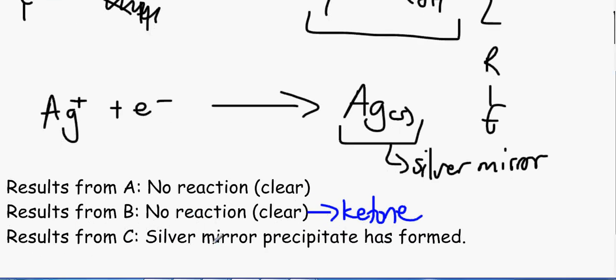And over here, a silver mirror precipitate has formed. So we know it's an aldehyde.